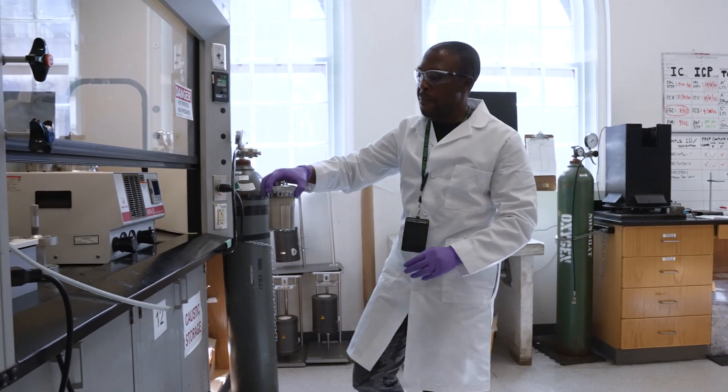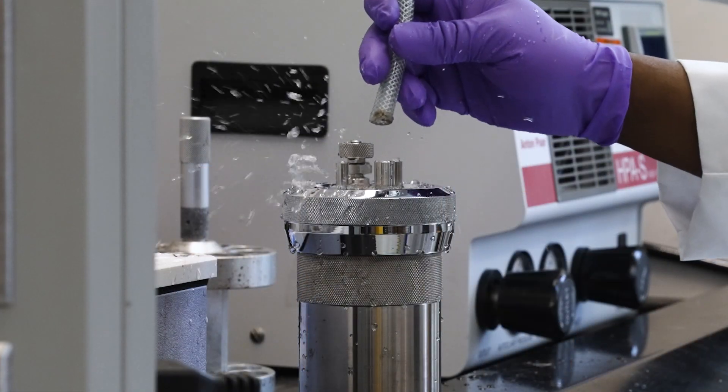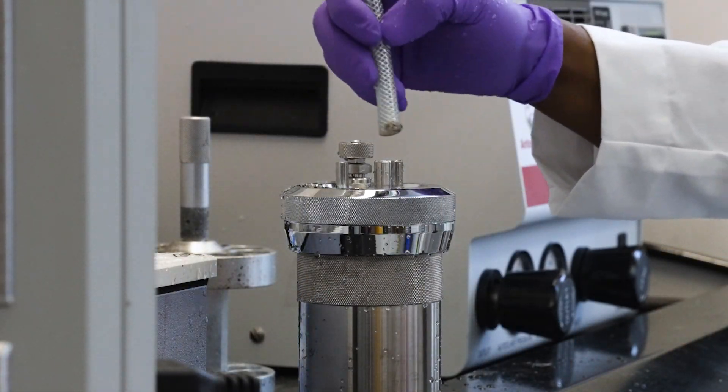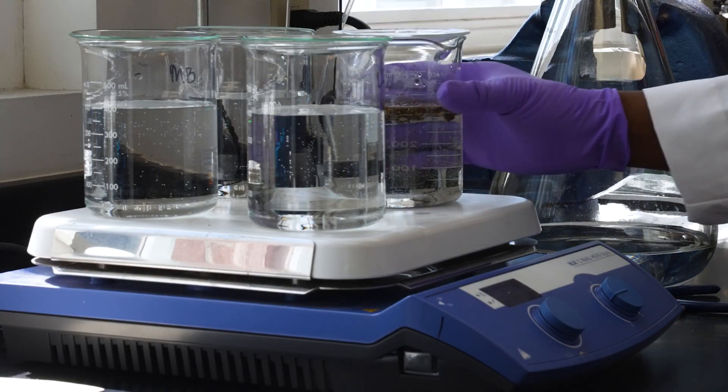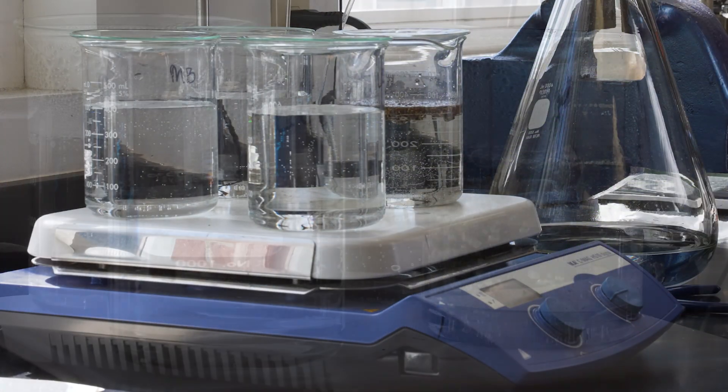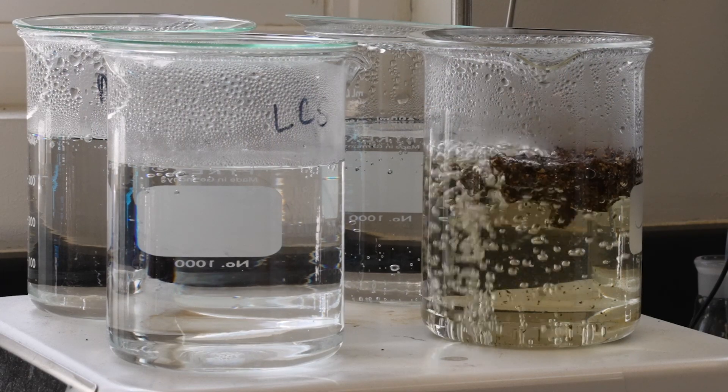The Detrimental Materials Program tests a variety of products for addition to the APL and QPL product lists. Some products are leach tested, where the sample is cut into pieces and heated in water. That water is then tested.